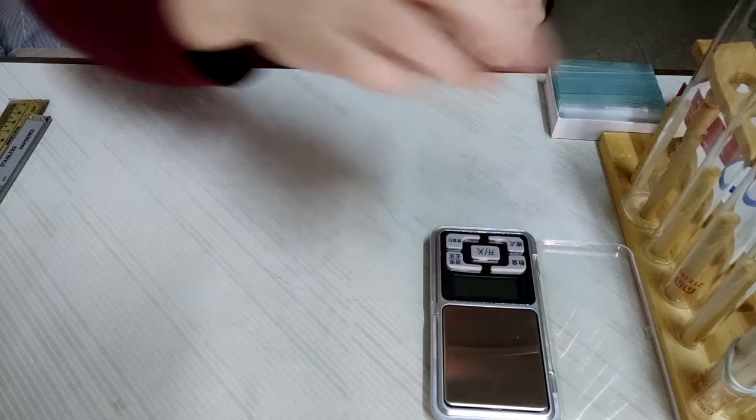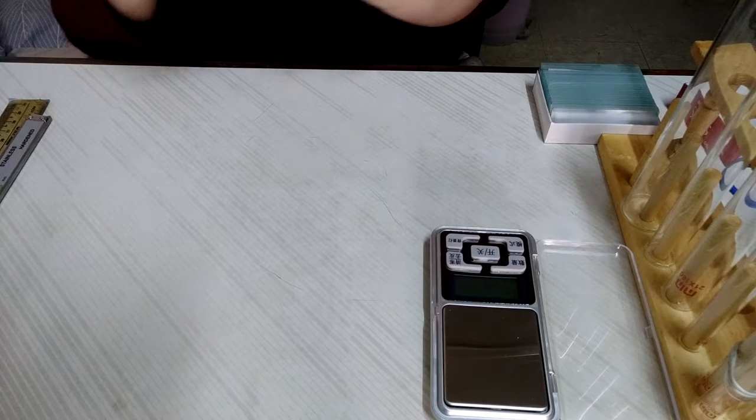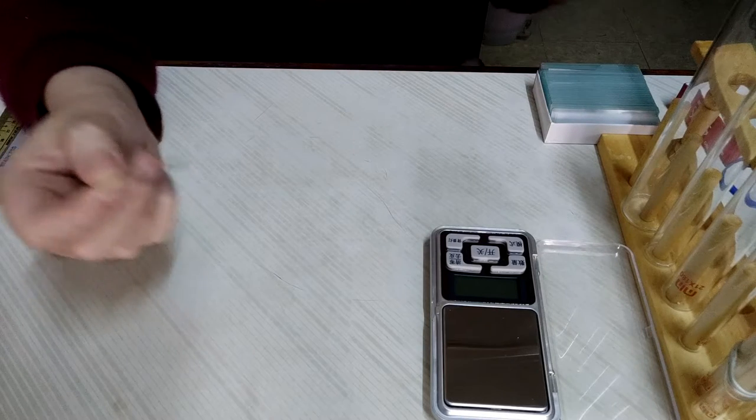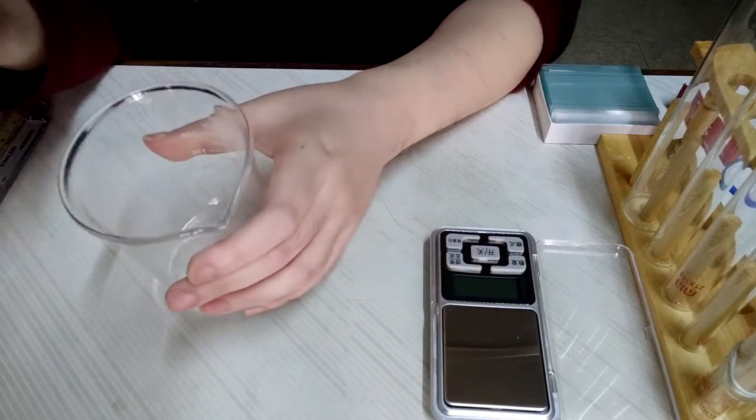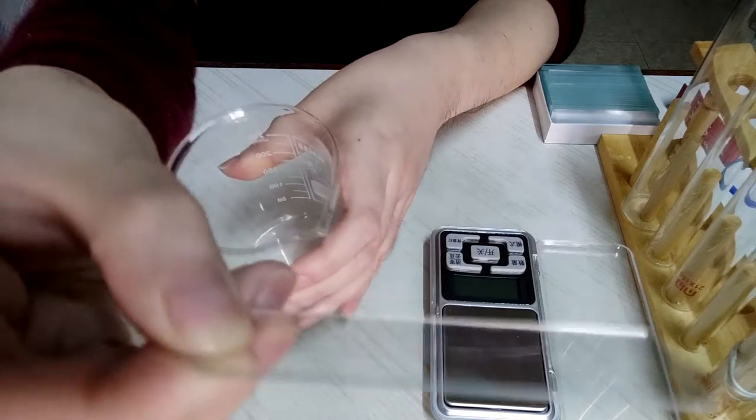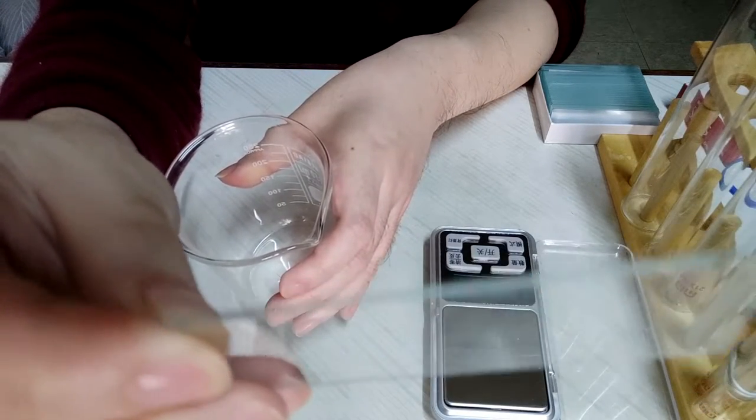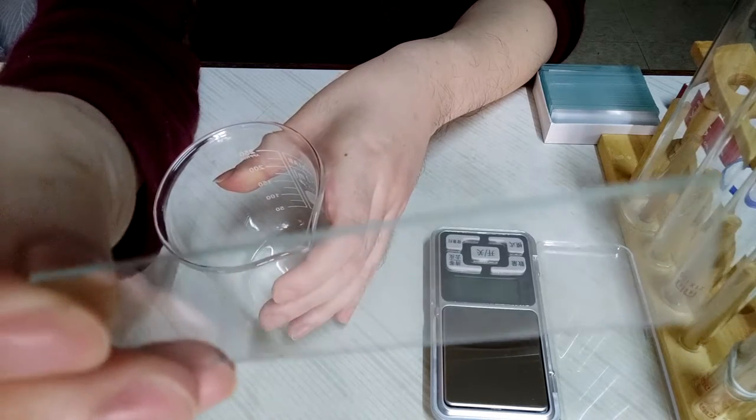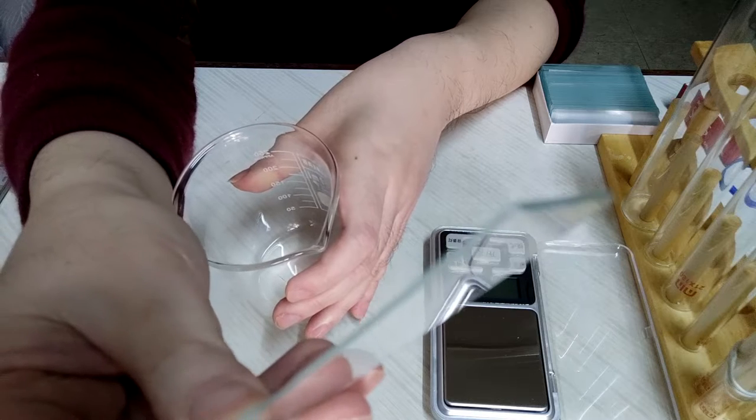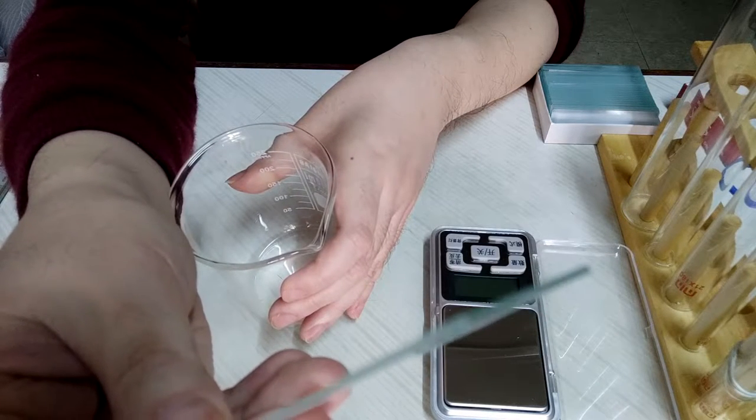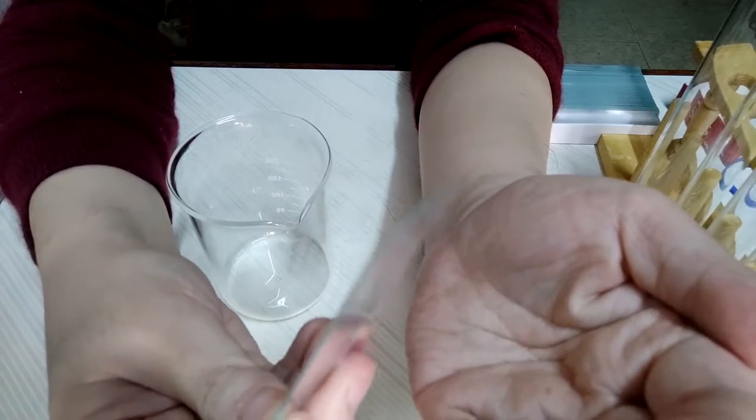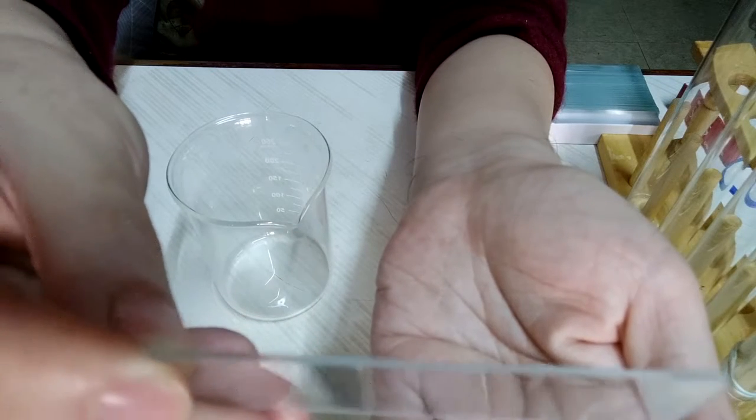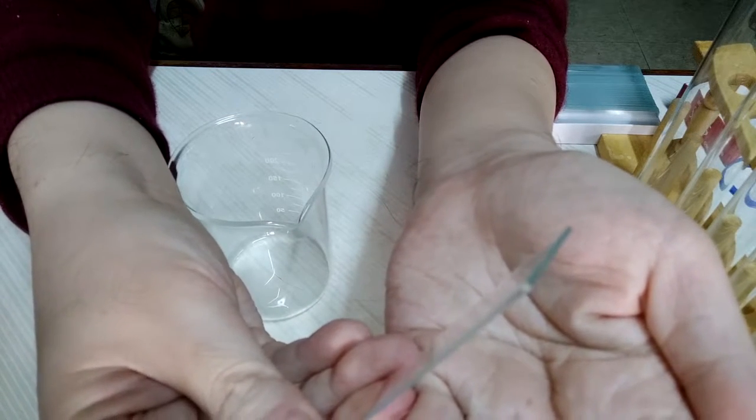But before we begin, I would like to bring your attention to the material of the glass. Some glasses, like this glass line, have a distinctive green or blue-green tint. When we look directly ahead, it seems transparent, but it is more noticeable there is a color on the side.